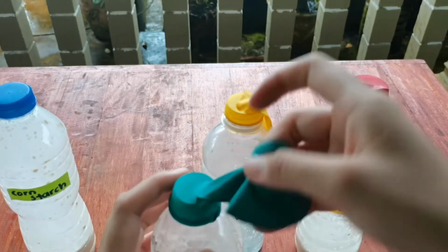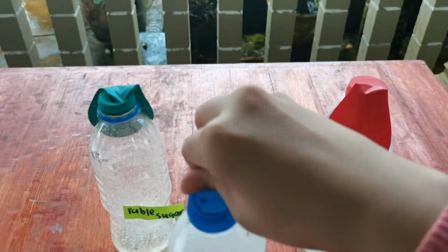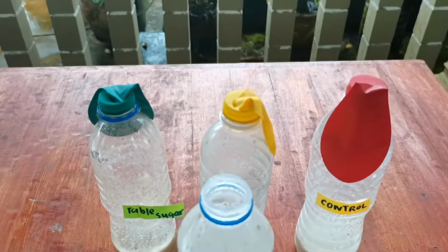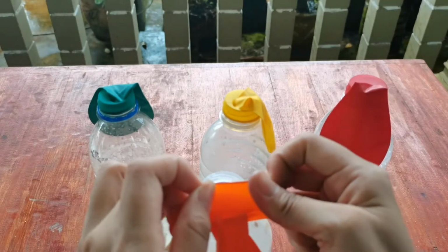After this, all the bottles are observed every 5 minutes for 25 minutes on what occurs in the bottles and any changes in the balloons.